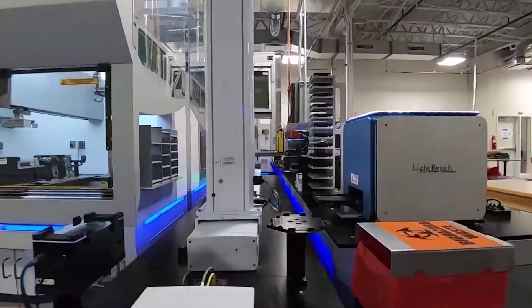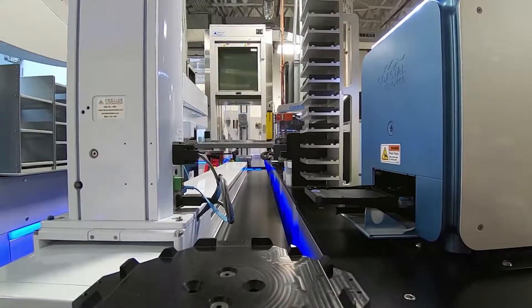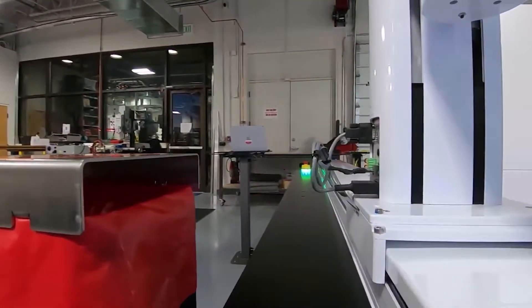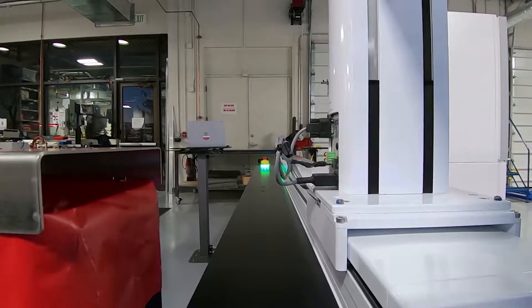This is our work cell sitting on a precise arm. We're moving through — we have two stackers of four-degree and ambient. This actually has all of our consumables and samples, pretty much anything the work cell needs, moving down this precise rail to one of our handoff nest locations.